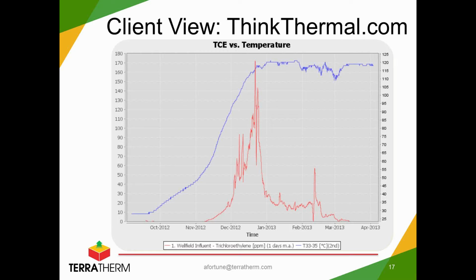We could quickly go on and say, yep, you're smelling something, but it's not related to our site, because we're monitoring the concentrations real time. So that was a great tool in this particular instance, and another potential feature that could be worked into other sites as well.